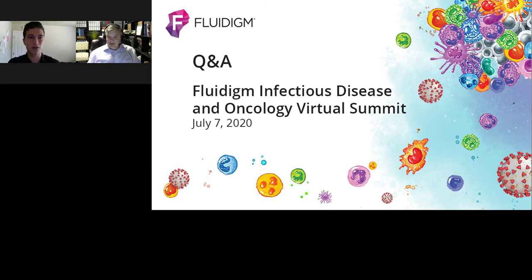Our first question is, is FCS Express 21 Part 11 compliant? Yeah, and thanks again for having us here and hosting the presentation today. I'm happy to take that question. So FCS Express does have the ability to enable 21 Part 11 compliant features in the software. The version of FCS Express that comes with the Fluidigm instruments will not have this enabled. However, you can contact our team at support@denovosoftware.com to get more information about that.